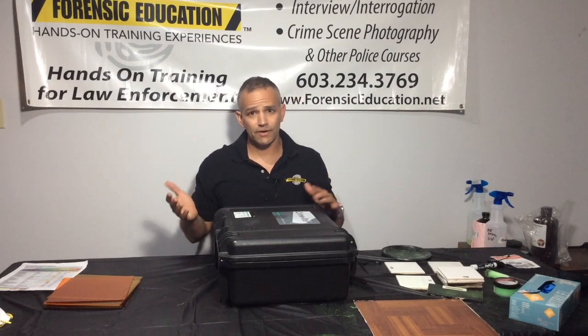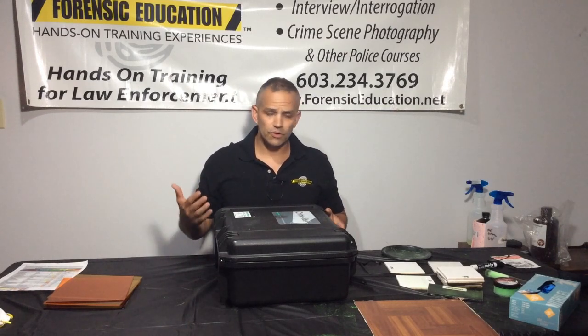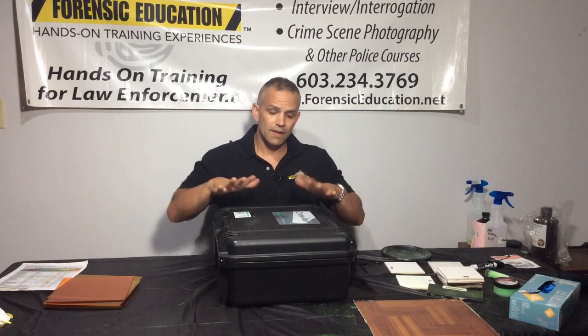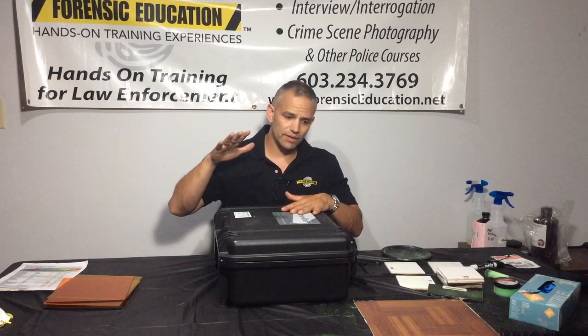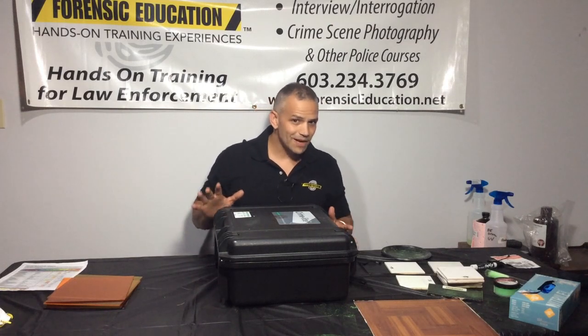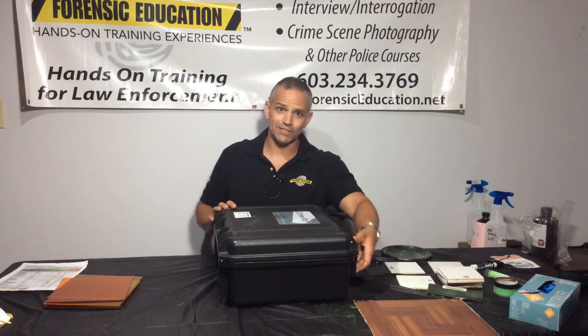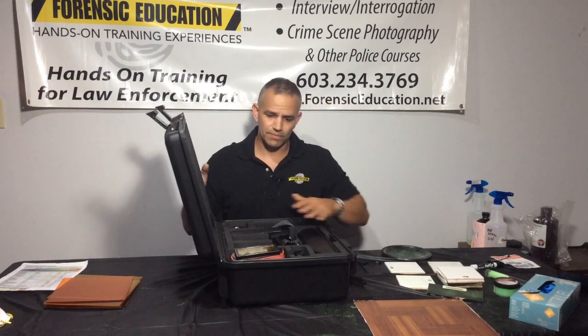Now on the scene, I usually carry a lower-powered handheld light that costs a few hundred dollars and it works amazing. But these are so powerful, you can't even match it. So let's open it up and see what we got — I've got another little surprise here for you as well. These are crime lights from Foster Freeman.